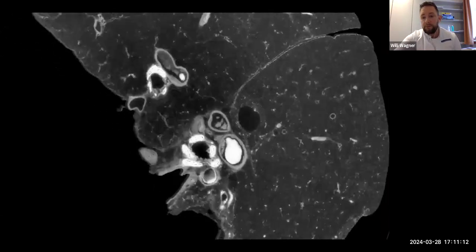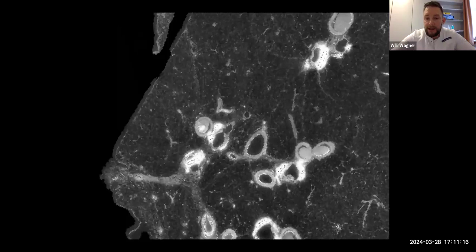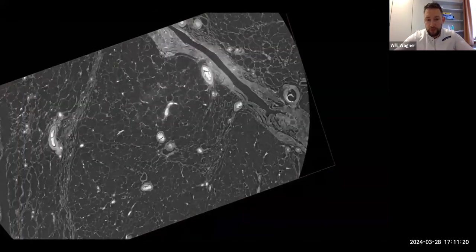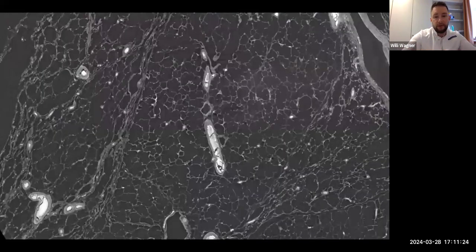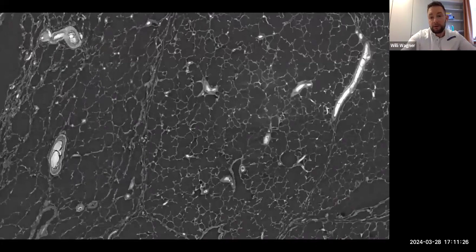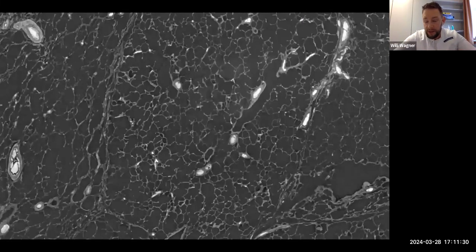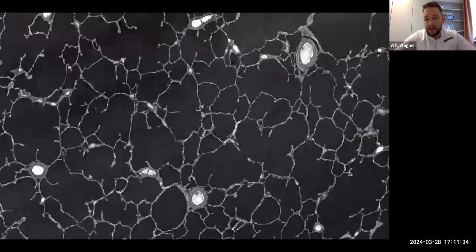They were able to do local tomographies within an intact lung in order to look at the entire organ, but also at very small scales without destroying the specimen.